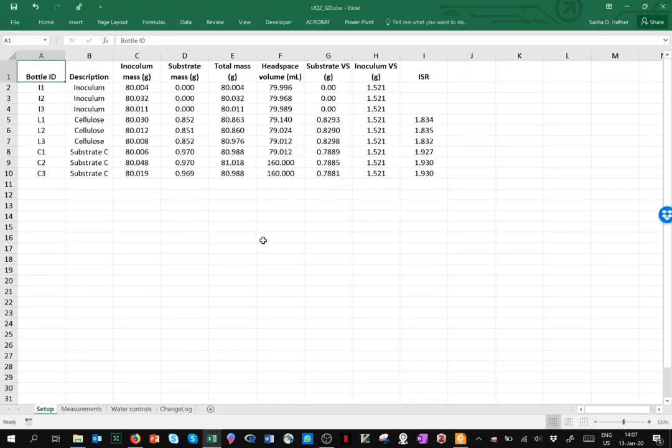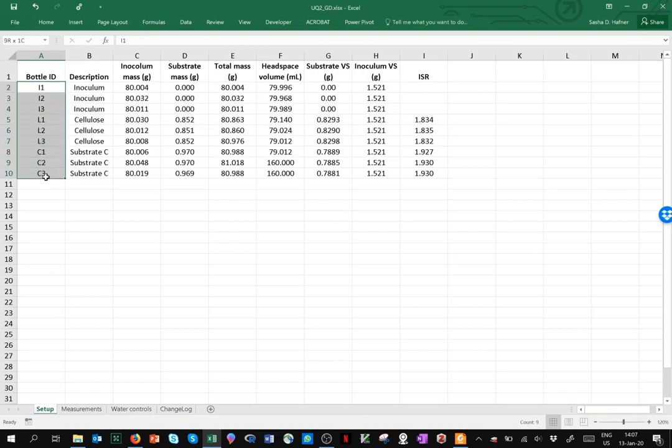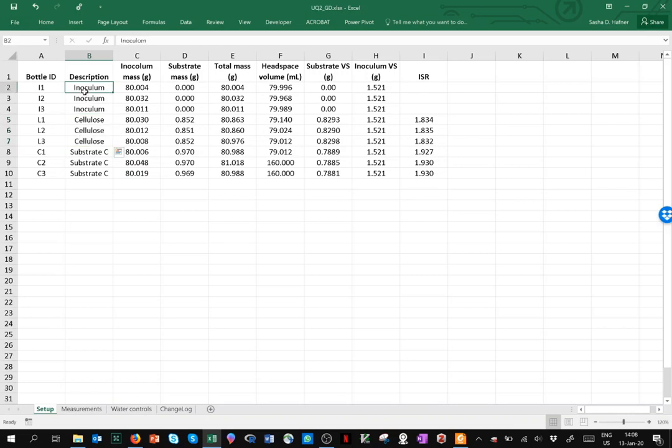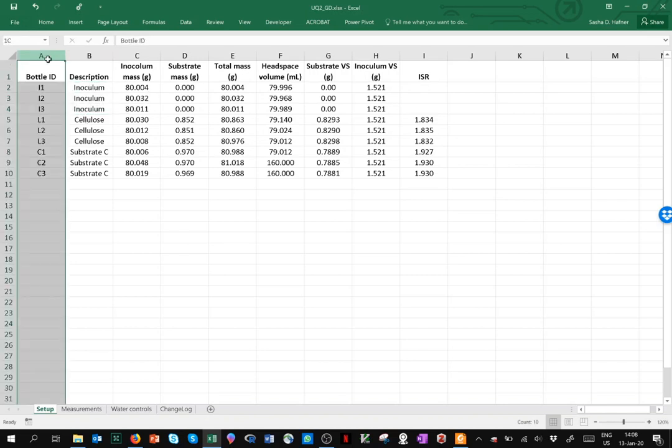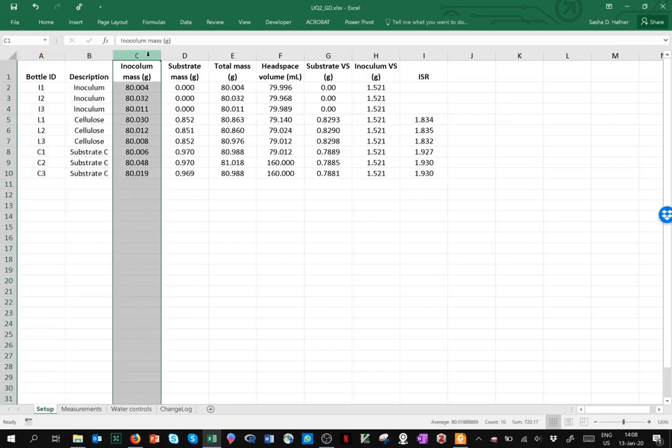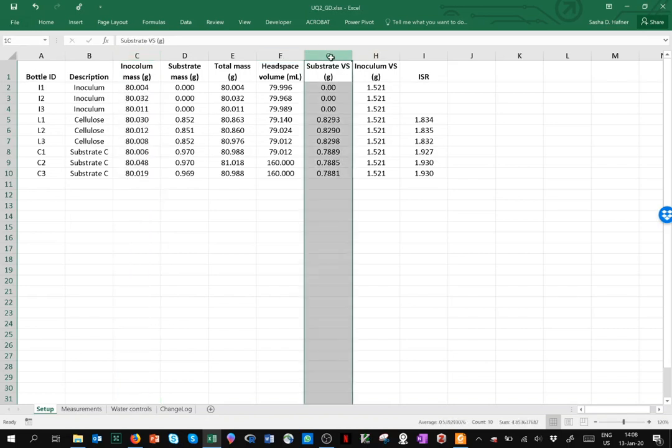Here's some data that were collected in a GDBMP experiment. We're interested in the data in two of the worksheets. The setup has information on what's in each bottle. There were nine bottles in this experiment for primarily one substrate, this animal feed substrate called substrate C. Cellulose was included as a positive control, as it always should be, to check the method. And then we have some inoculum-only bottles needed to determine endogenous methane production from the inoculum. What's essential here? The first two columns of course, then we need to know how much inoculum was added to each bottle and how much substrate VS was added.